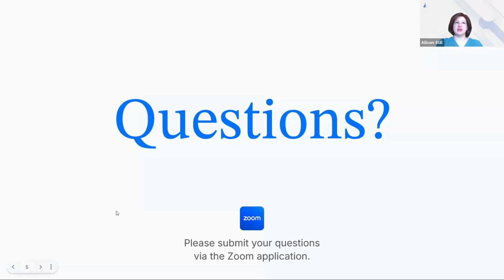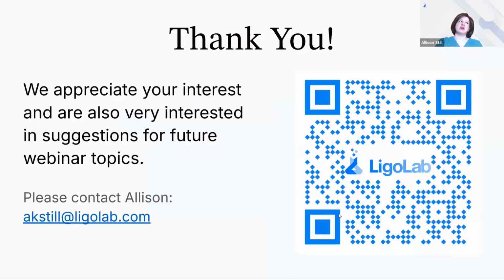LigoLab to be a lot better. I know I'm a little bit biased, but the performance was better, and not just the working performance, but the reliability. Other LISs I worked with would sometimes crash or go down, which we never had a problem with Ligo doing. I mean, unless there was a lab-wide internet outage or something like that, of course. It was easier to work with, had better work lists.